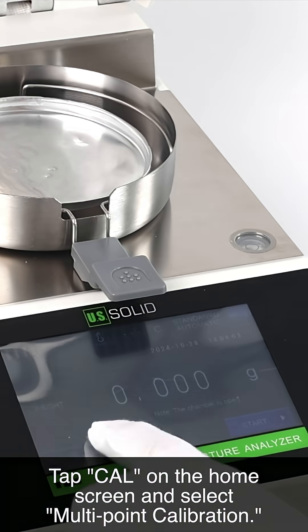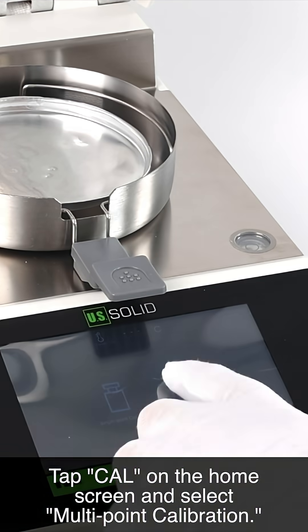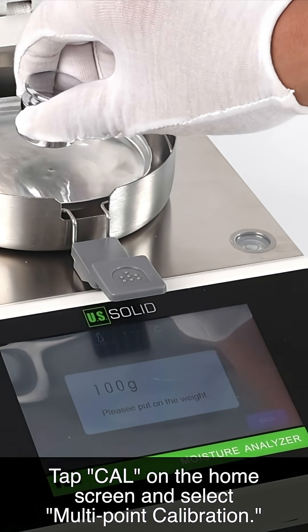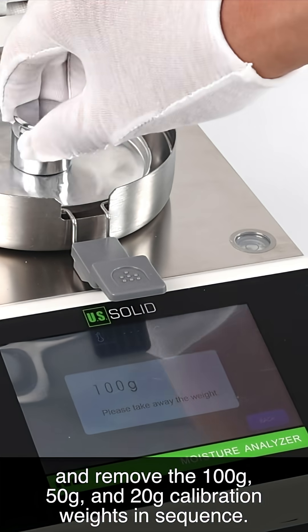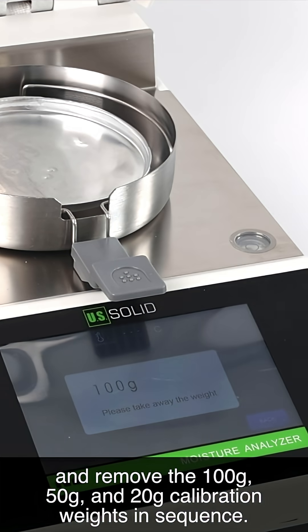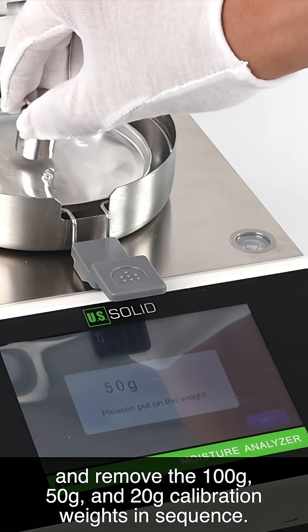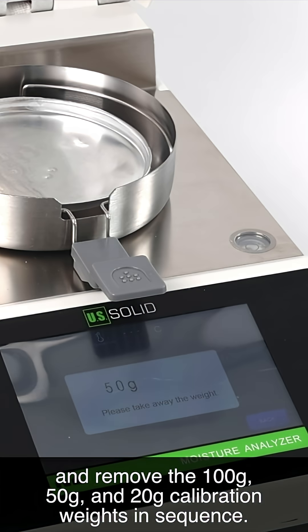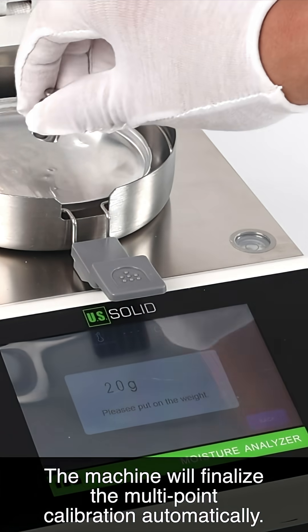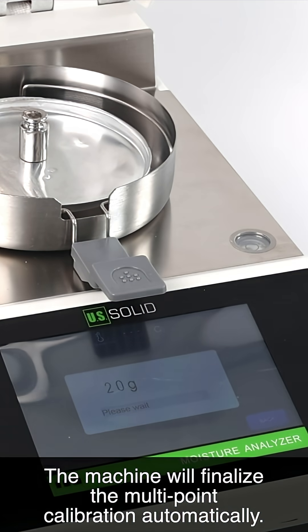Tap calibration on the home screen and select multi-point calibration. Follow the prompts to place and remove the 100 grams, 50 grams, and 20 grams calibration weights in sequence. The machine will finalize the multi-point calibration automatically.